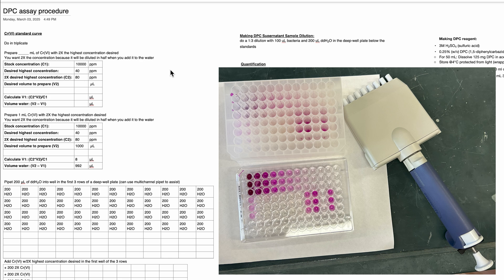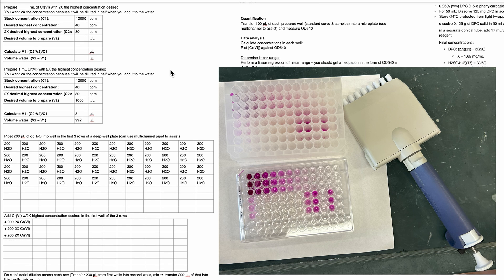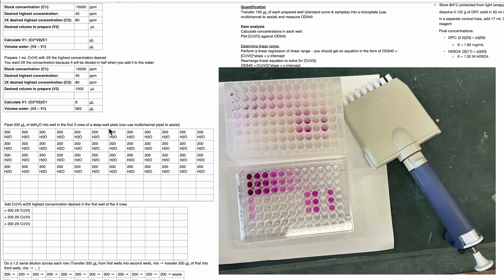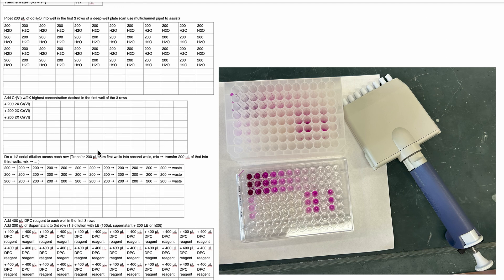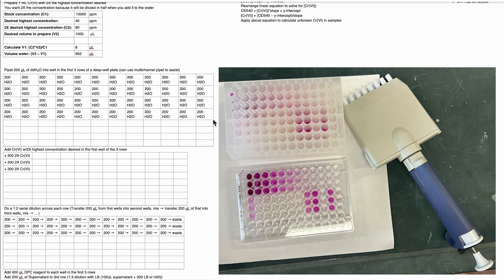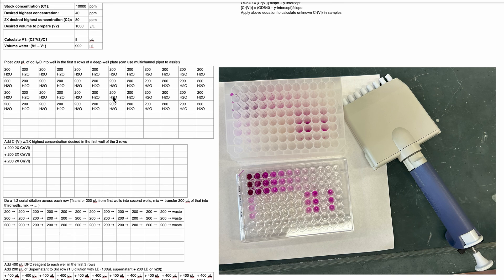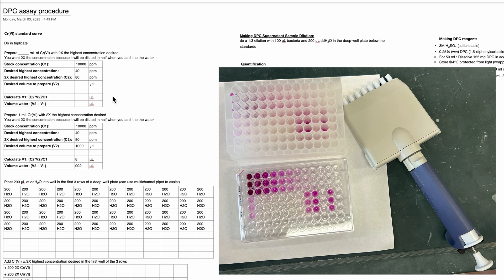A technical note: I typically use a plate reader assay, and the plate reader plates only hold a certain volume. For serial dilutions and sample dilutions, I want a larger volume, so I prepare everything in a deep well plate. I then use a multi-channel pipette to add water to the wells, add the chromium stock to the first well, serial dilute across, and add the samples — then transfer directly from the deep well plate into the plate reader plate.